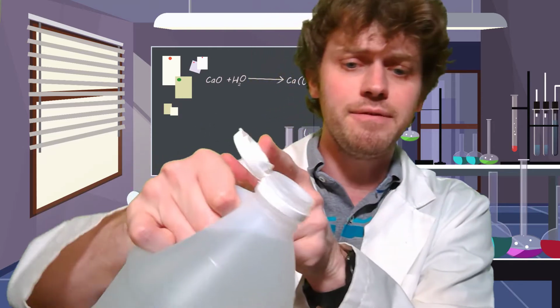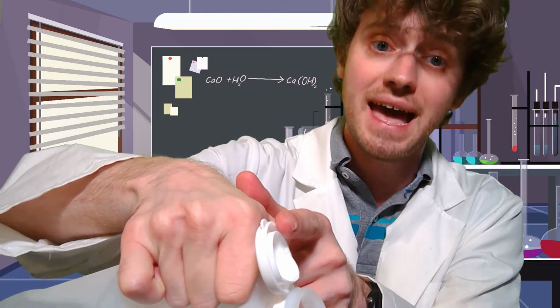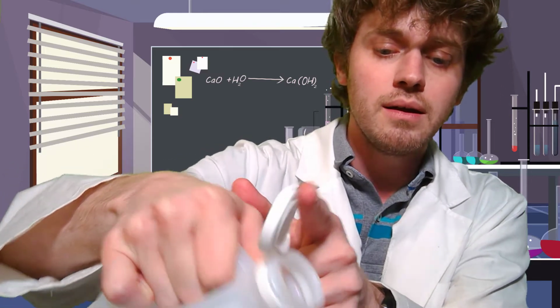All right, so we've taken our mass and circumference measurements, and you can see that on the cup that I'm going to use, I have written those down. And now I'm going to pour in some vinegar. So it doesn't really matter how much I have. I just want to make sure that it's going to end up covering my egg. And so I'm going to, I probably should have my egg in there first, but you know, it is what it is.